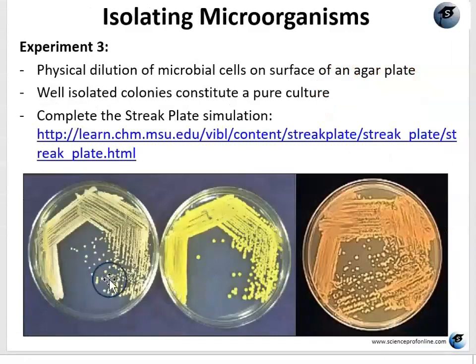So this is what they tend to look like in real life. Each one of these little dots that's by itself is an individual colony, and those individual colonies derived from single cells. So you know that they are 100% pure culture.